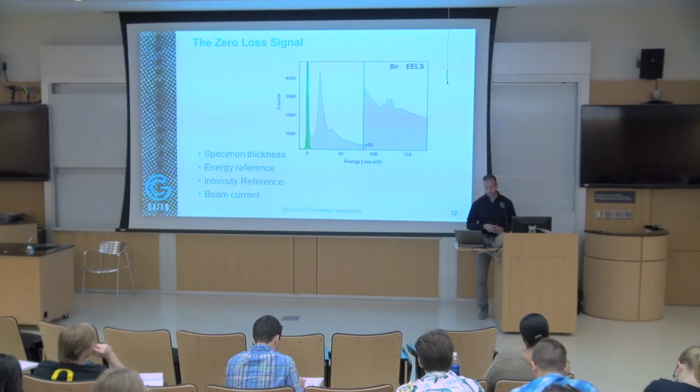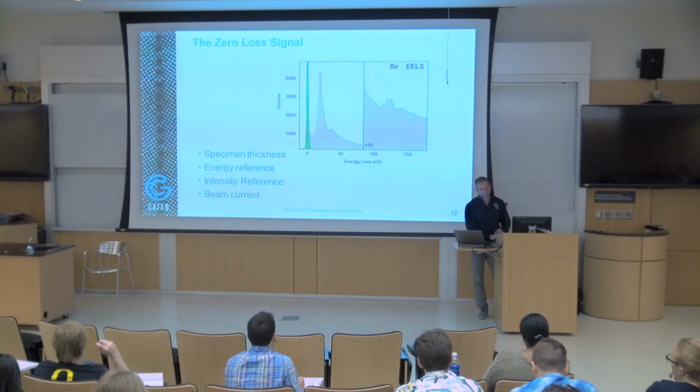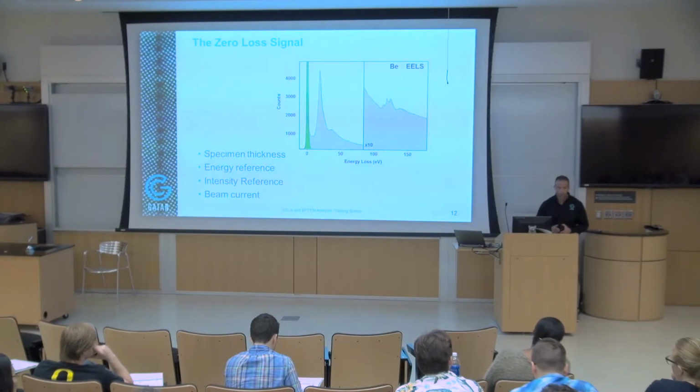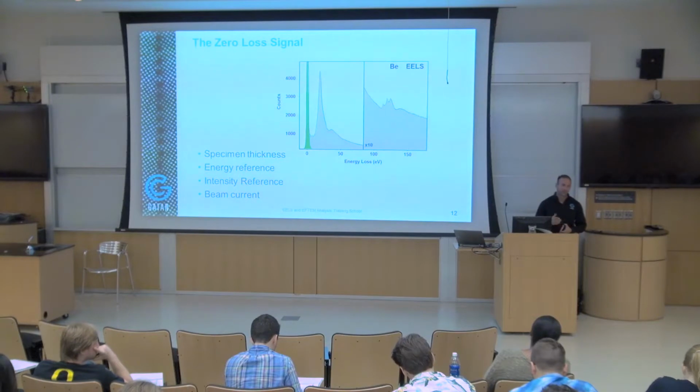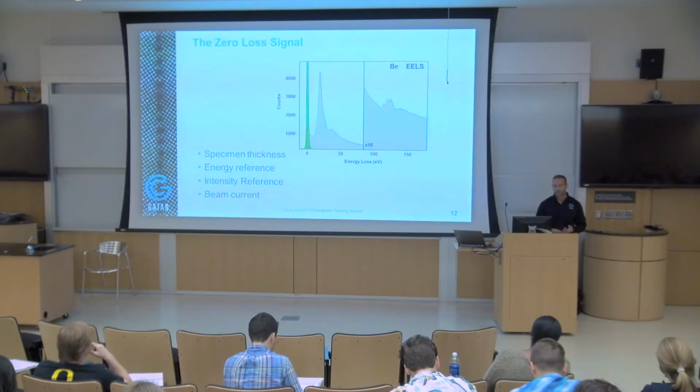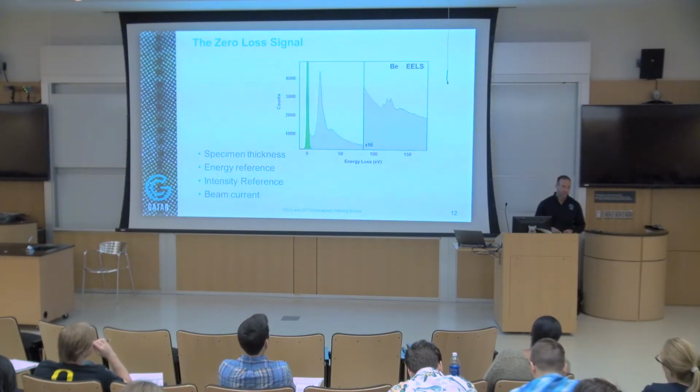And a follow-up question. So if you have, say, the element hafnium and hafnium oxide, and your sample is varying between these two, how do you calculate lambda in those two cases? So what we use to work out the lambda, there's something built inside the software. That is the easiest way. You need to work out what they call the effective atomic number. So say hafnium is 60 something, so for hafnium oxide you have to work out the effective atomic number. The software, especially the new software, automatically works out the concentration. From the concentration, you can work out the effective atomic number, and from there, your accelerating voltage and experimental conditions, the software works out the lambda, and as a result, the absolute thickness.